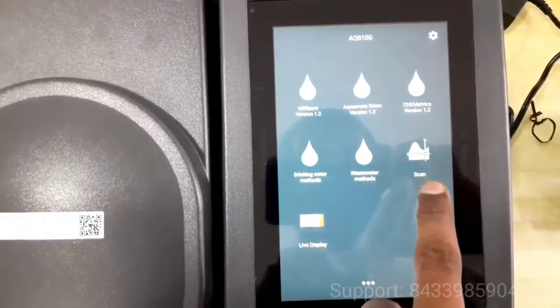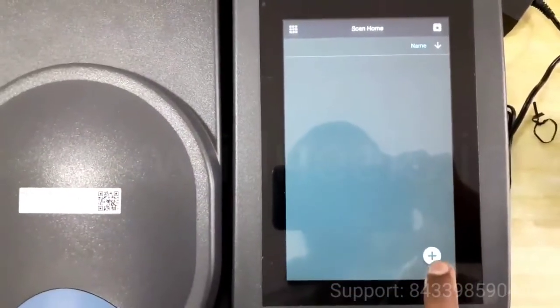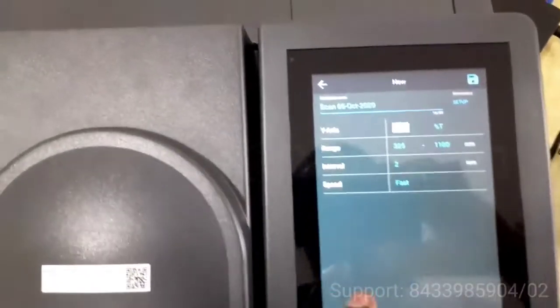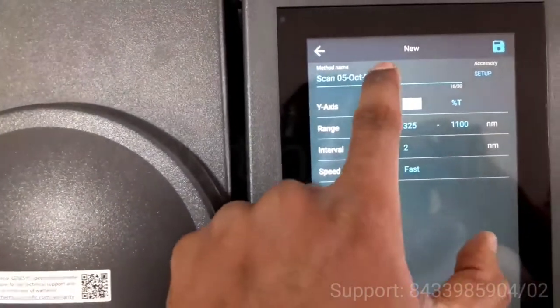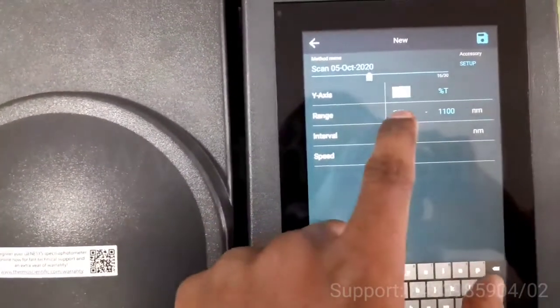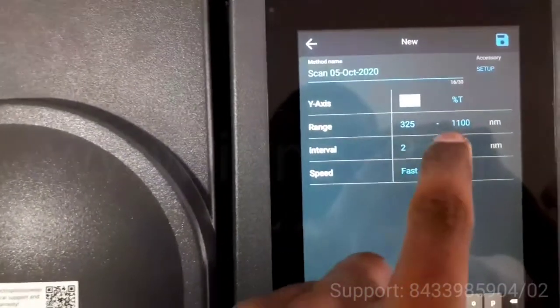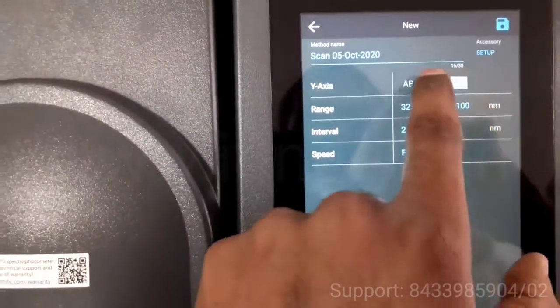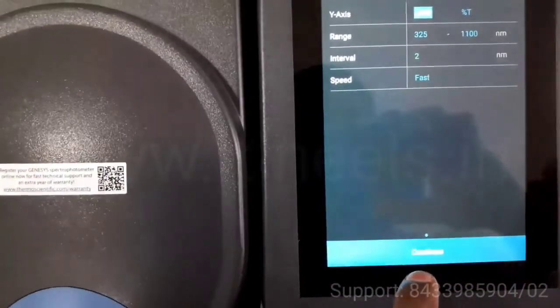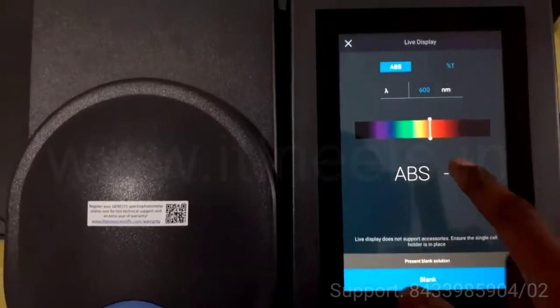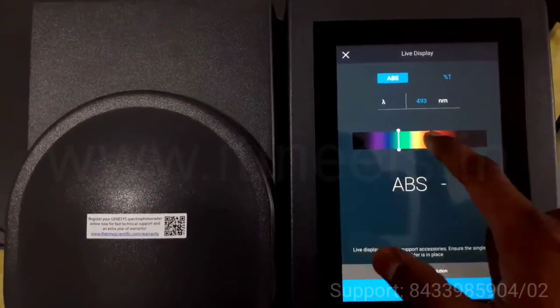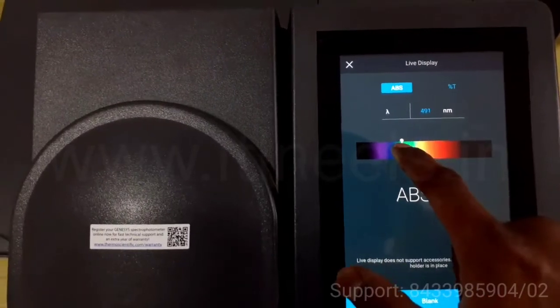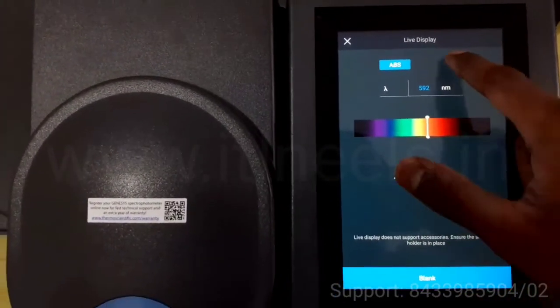In scan mode, you have to add a new method. You can change everything: the name, the range, interval, transmittance and absorbance, which axis you want. Then press continue. In live display mode you can change the wavelength, and simultaneously it will show the absorbance or transmittance over here.